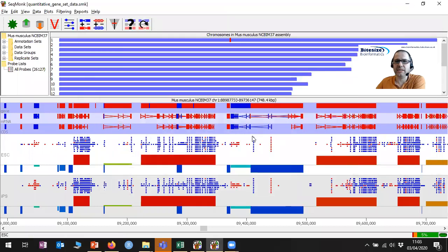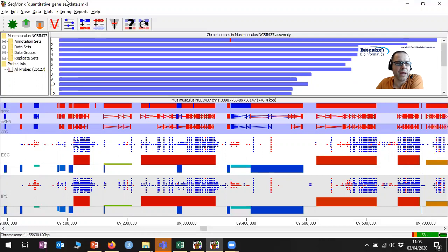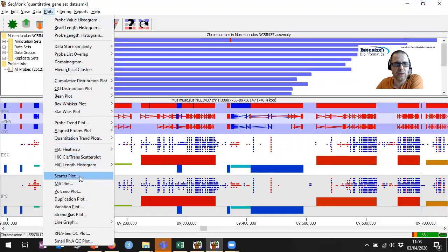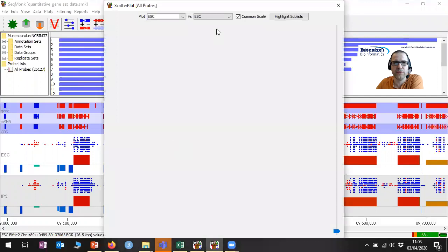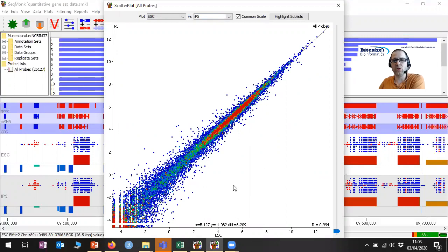I've got a dataset loaded in already. This is an RNA-seq dataset where we're comparing two conditions: the ESC and IPS conditions. I've already done a standard RNA-seq quantitation, and if I have a quick look at the comparison of the two in a scatter plot, you can see what this data looks like. We can see some genes that seem to be changing quite a lot, but we also have a bunch of things that are changing by relatively small amounts.